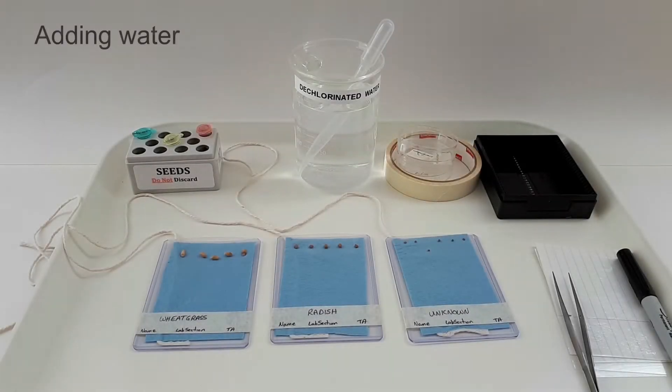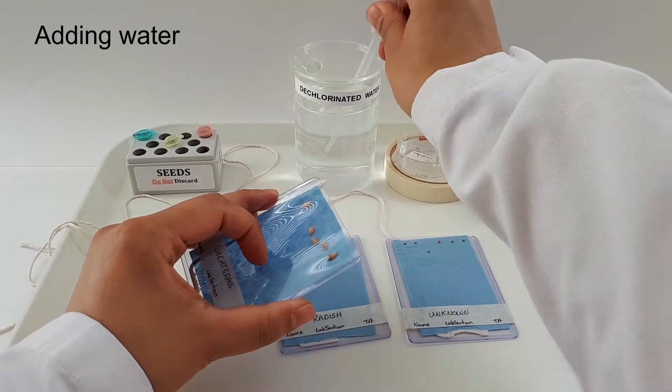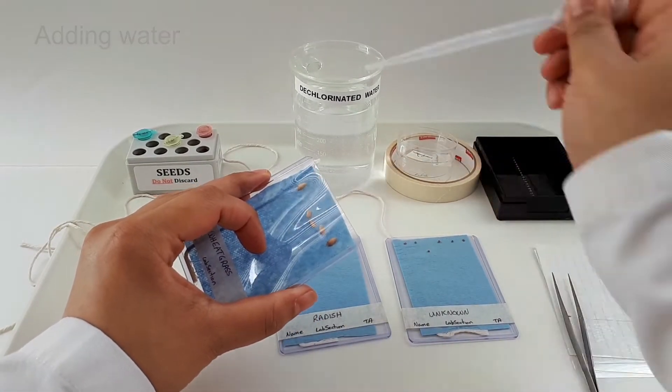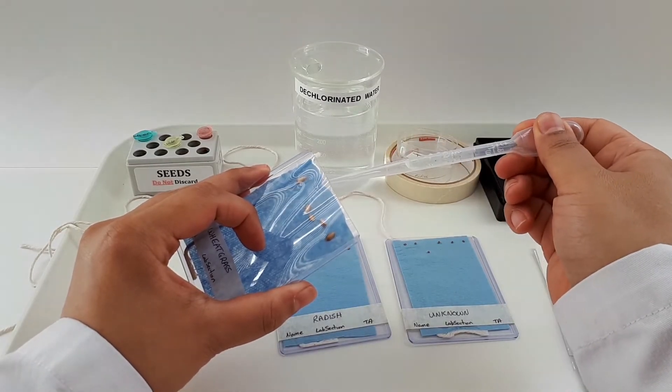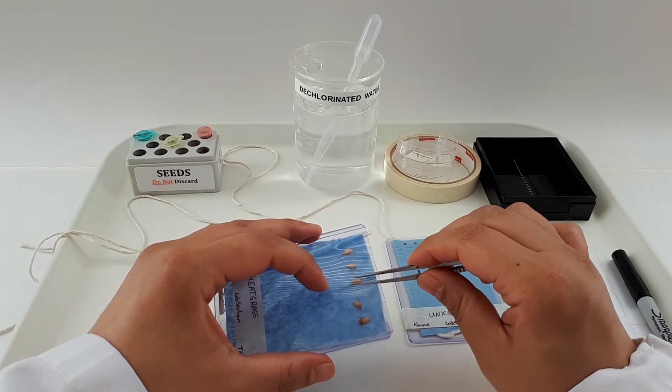Use a plastic pipette to add five to six milliliters of dechlorinated water to each pocket. If any of your seeds get displaced during this process, you can use the forceps to get them back into position.